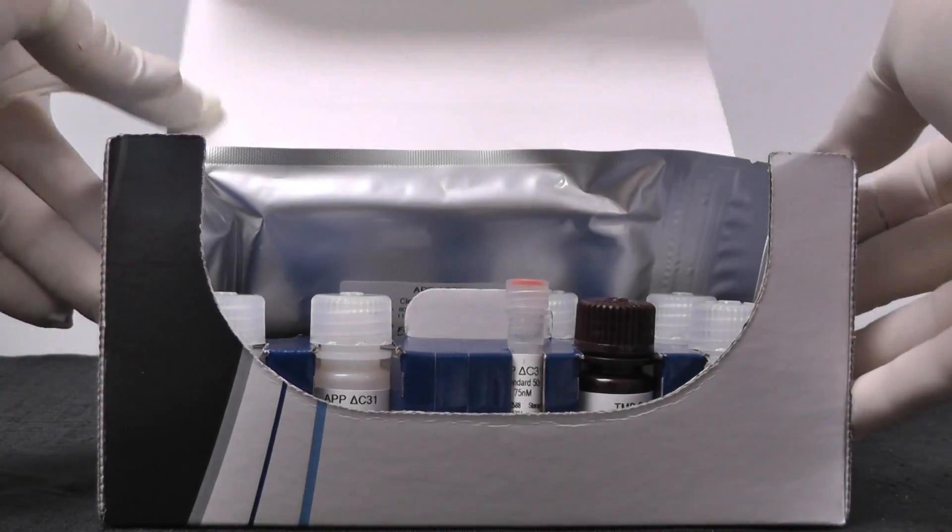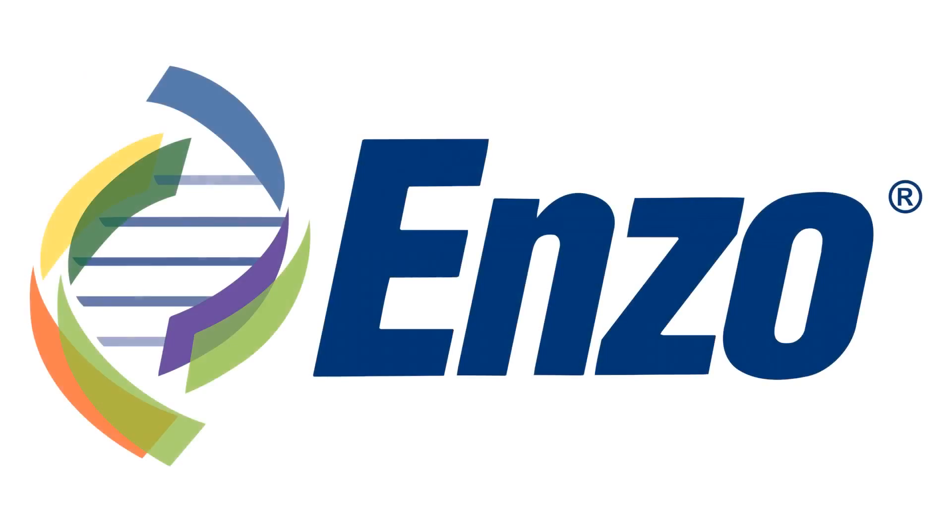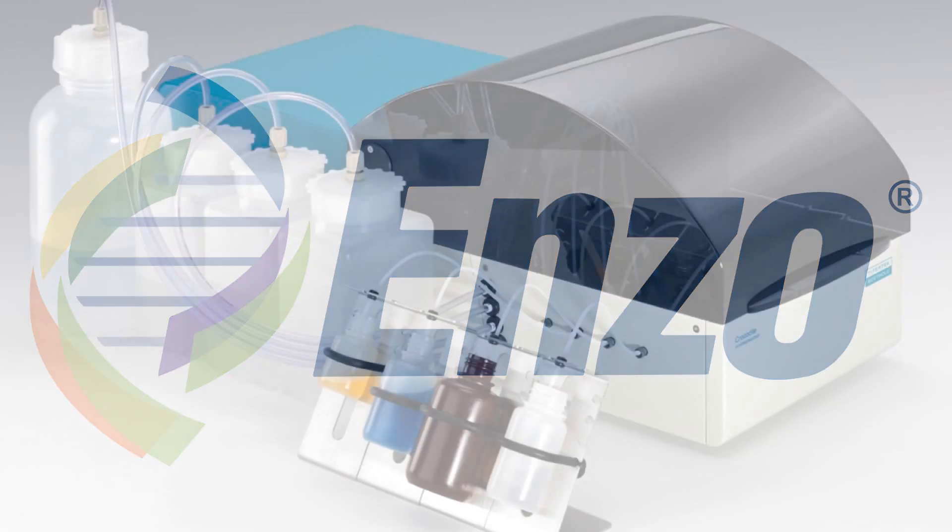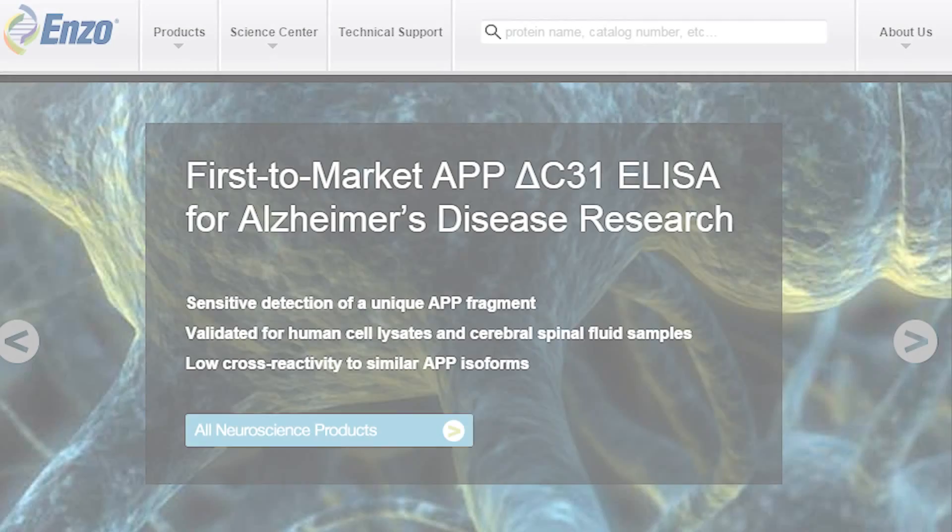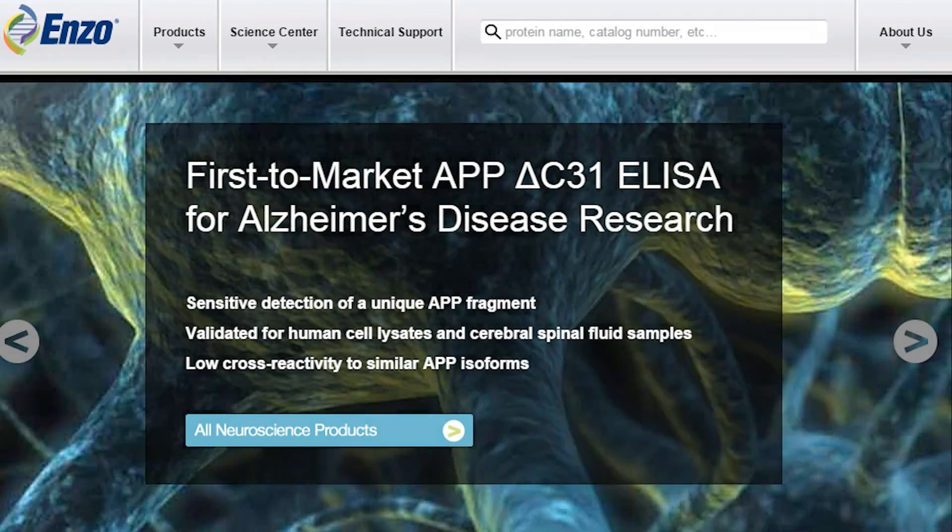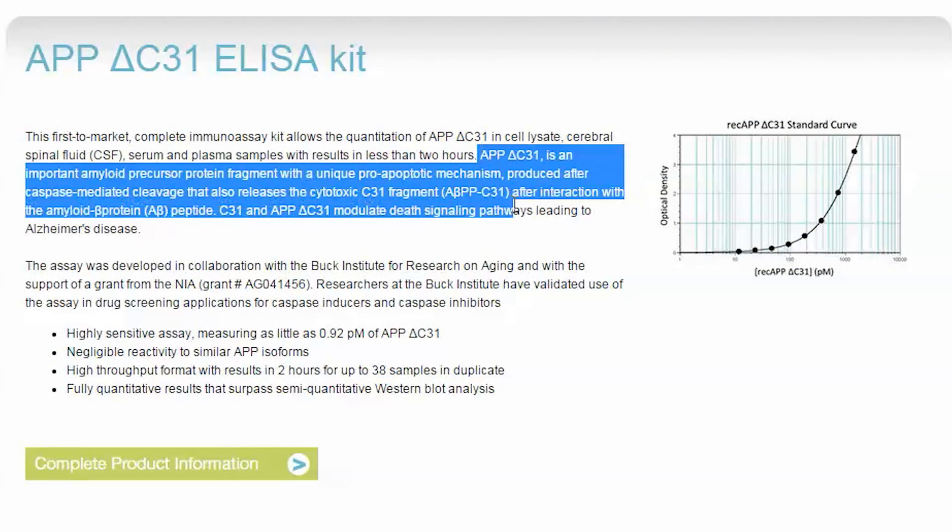Here we show the setup of APP Delta C31 ELISA from Enzo Life Sciences with Crocodile Mini Workstation. APP, amyloid precursor protein, plays an important role in the pathogenesis of Alzheimer's disease.